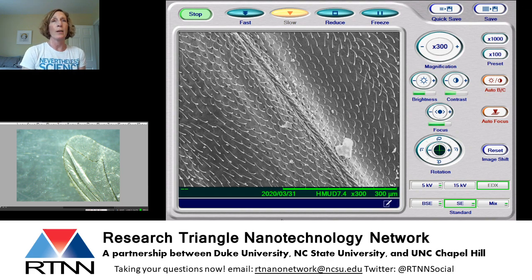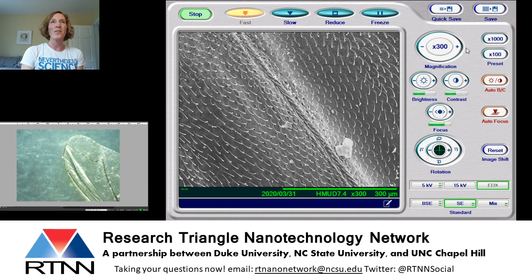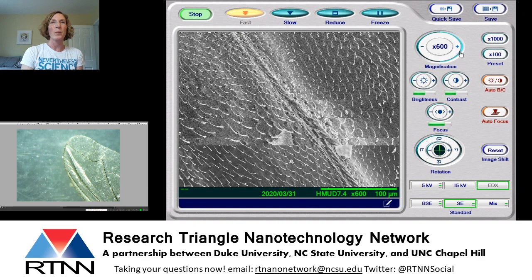To give you guys an idea of how small that is, if you take one of your hairs and you pull it out and you look at the skinny way across it, that's about 100 micrometers across. So in this picture, if you stuck a hair in, it would be about this big. So we're looking at something that's pretty tiny. But you know what? We can zoom in even more. That's the whole point of this microscope, right? So let's go fast here so we can zoom in a little bit more.